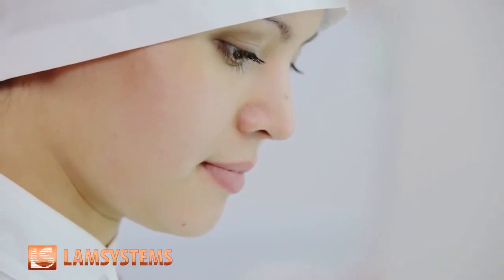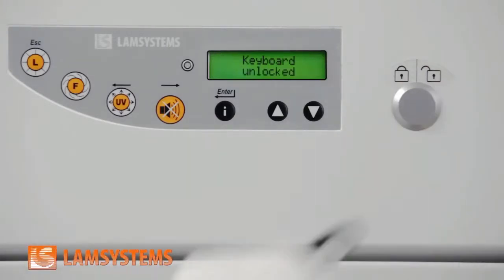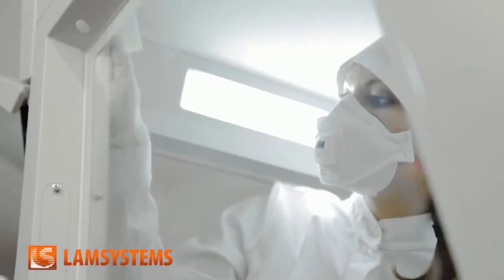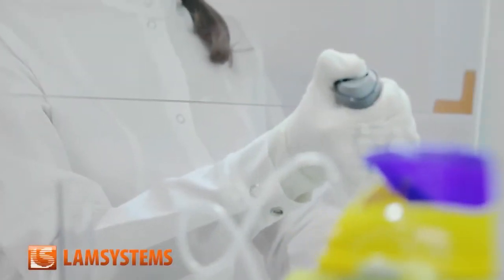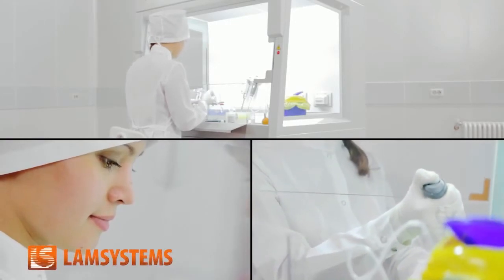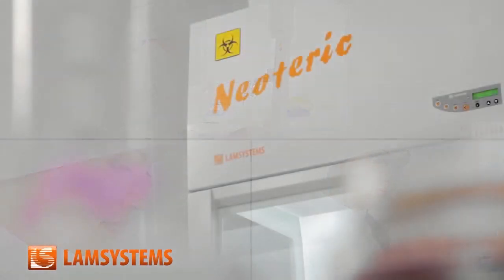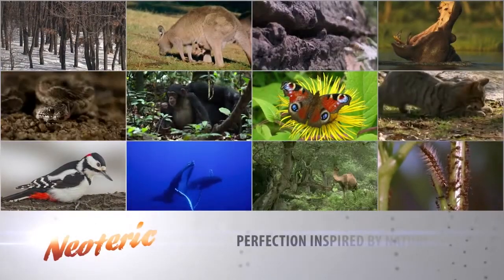To focus completely on your work, leaving control to a reliable control system. To save time and effort during sanitation and disinfection. To equip your laboratory with cabinets which will be certified and help organize the working process at the world standard level. All this is possible with the new biosafety cabinet Neoteric, made by LAM Systems. Neoteric — Perfection inspired by nature.